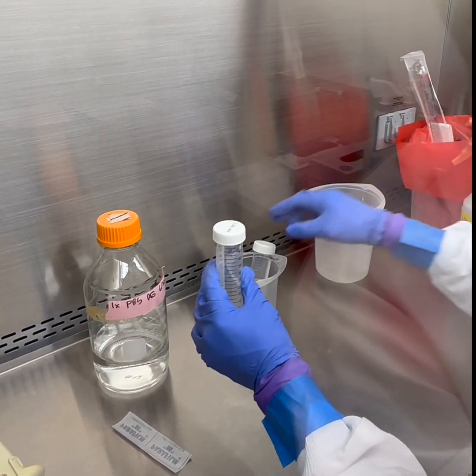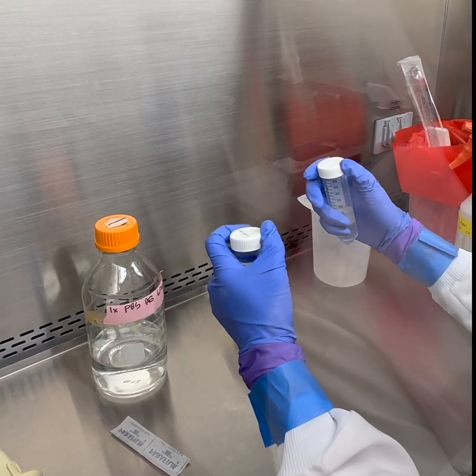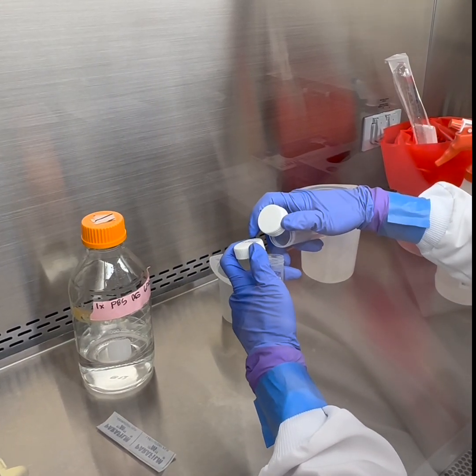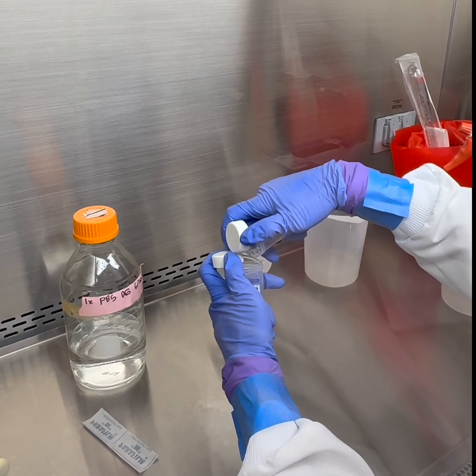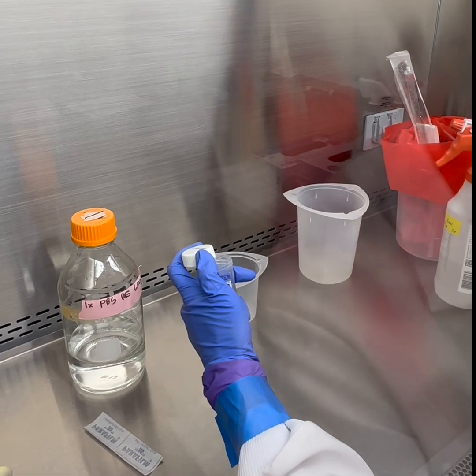And now we're going to want to resuspend the pellet in PBS and wash it one more time. This is our last wash, so I'm just going to pour it. A little shaky today, but it's okay. All right, we're all done with this PBS, so I'm just going to throw it in here.